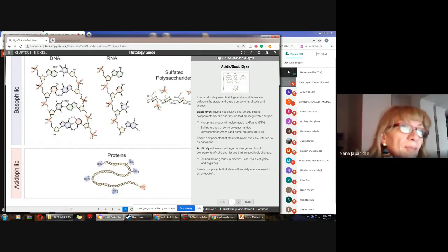In the cytoplasm, we have rough endoplasmic reticulum, which has ribosomes on the surfaces, and ribosomes, as you know, contain ribosomal RNA, plus transfer RNA is also represented in the rough endoplasmic reticulum. That is why all these structures are very well stained.